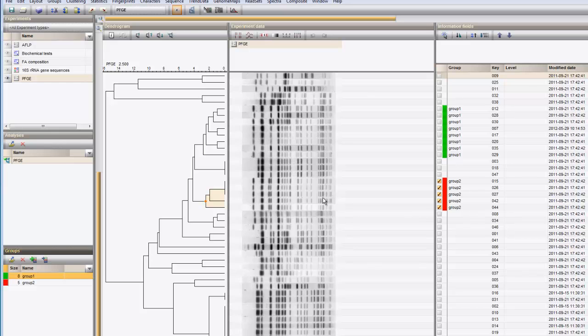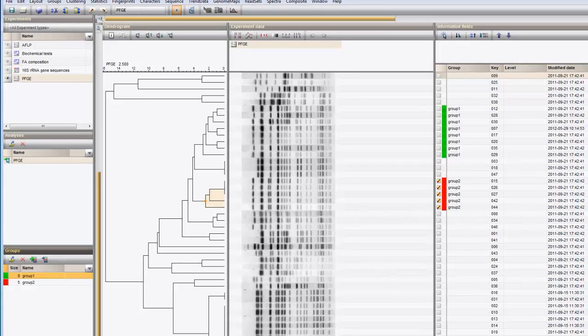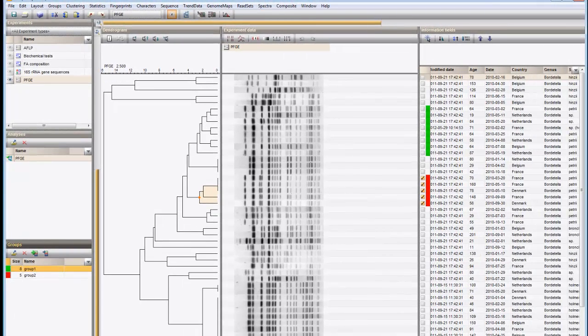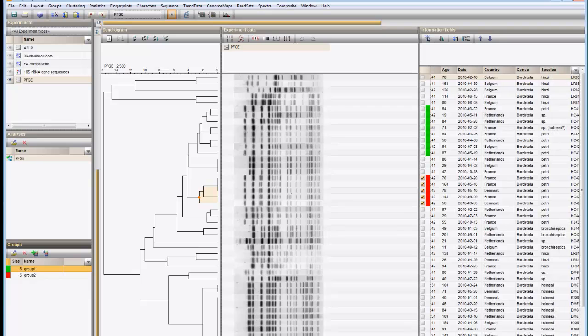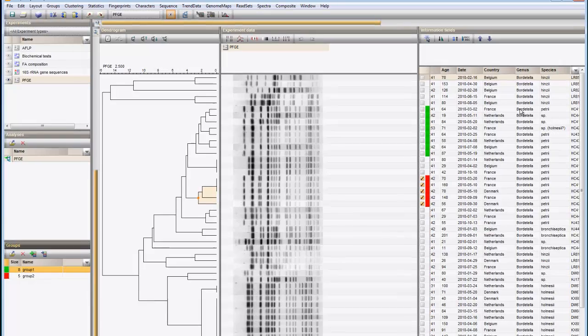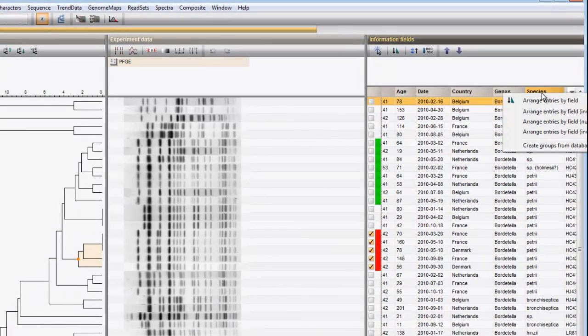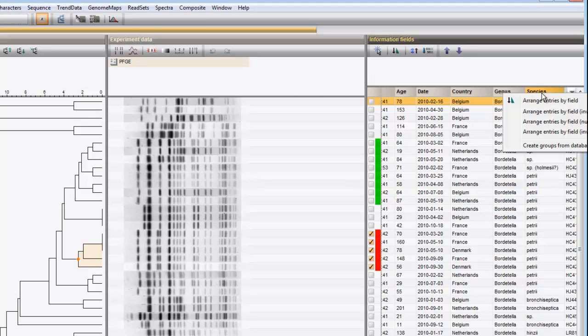Or I can have the groups assigned automatically based on the content of a field. For example, I right-click on the Species field and select Create groups from database field.